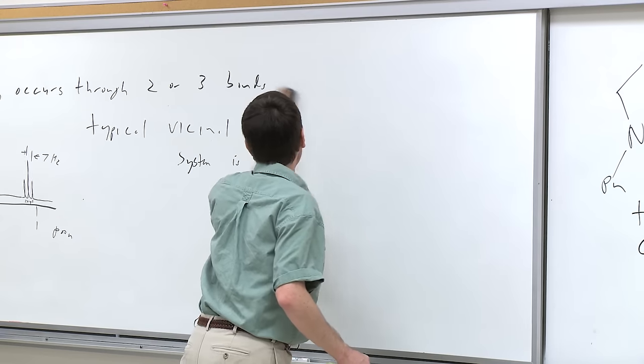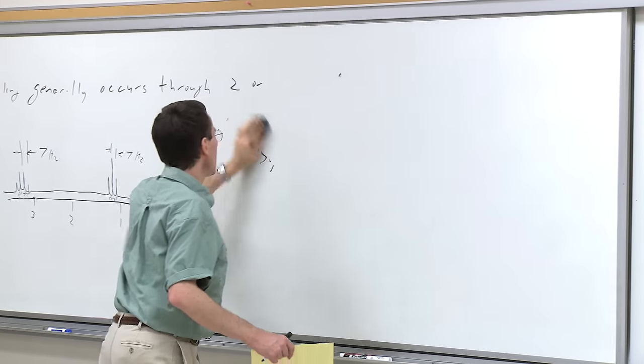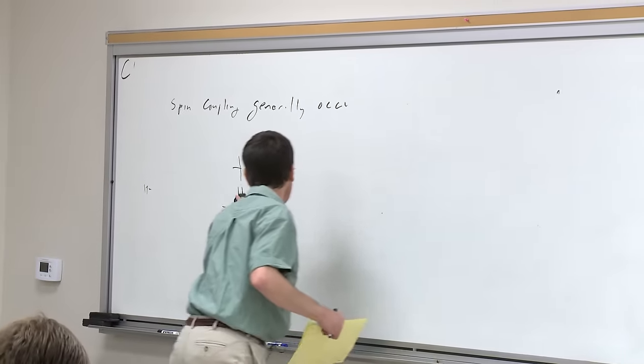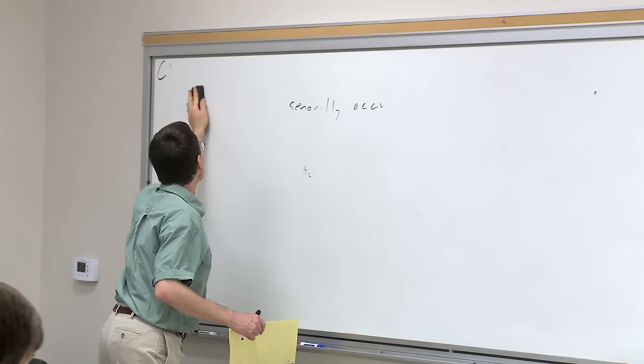All right, I want to give you a couple of more typical coupling patterns, and then we can sort of play with these and use them with some real data.